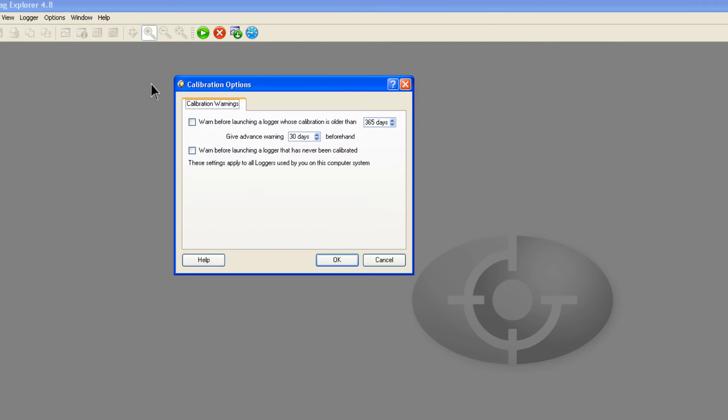If you are using a data logger that has been calibrated, you can set a reminder to prompt you when your logger needs to be checked again.